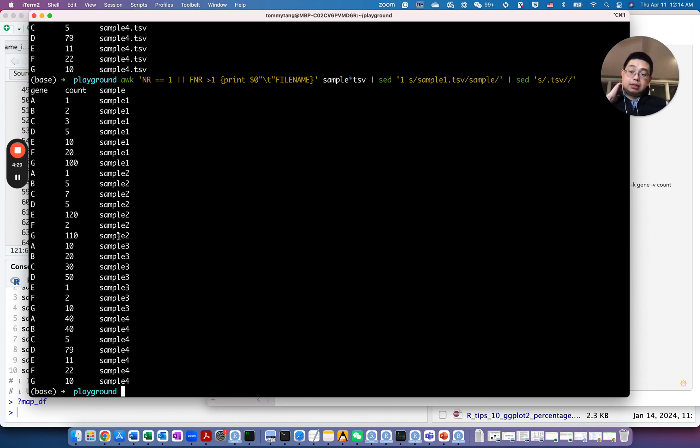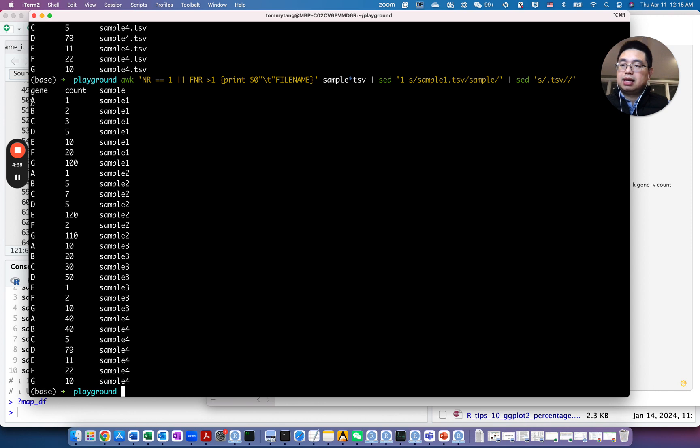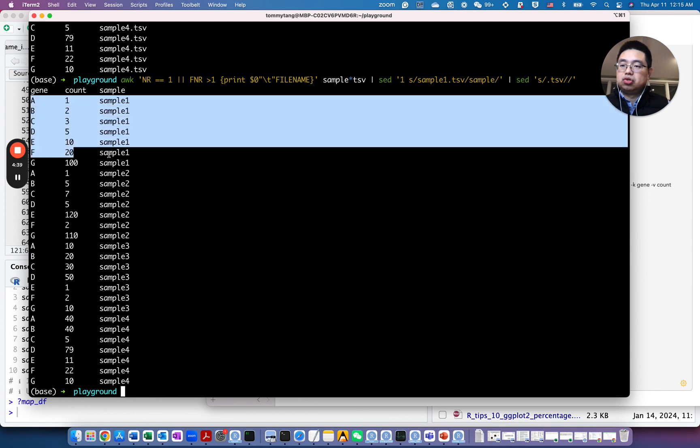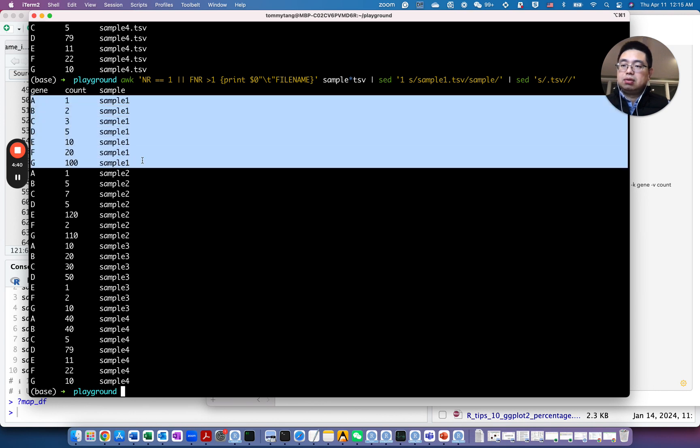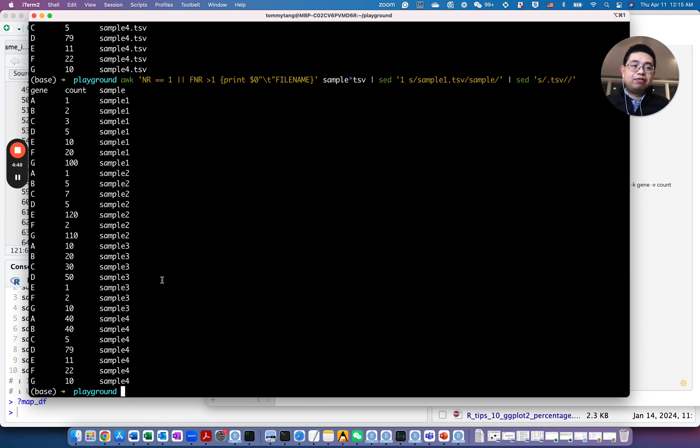So this data still is in this long format, right? So we have three columns here, and we can identify these genes from which sample those counts are from. And to actually wrangle it into a wide format, it's more like rows are genes, columns are the samples.